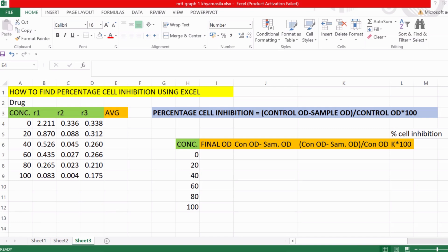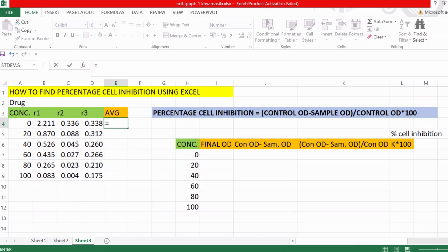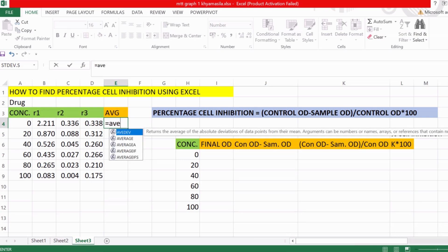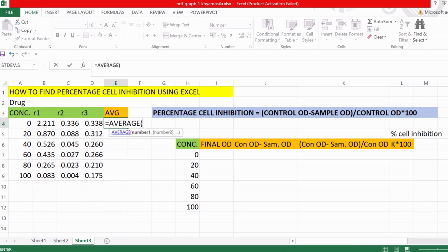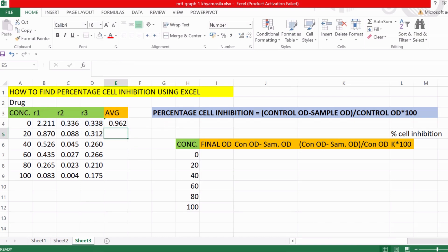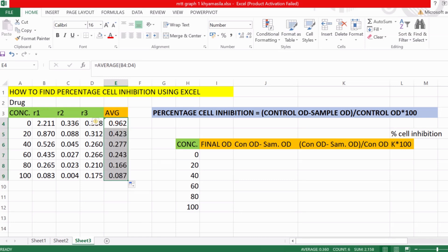First, what we need to do is find the average. To find the average, put an equal-to sign, search for the AVERAGE function, then select these three cells and press Enter. This gives the average of the control — zero is the control. Then drag this formula down to the last concentration, and it will give separate average values for each concentration. This average is the final OD which will be used in finding the percentage cell inhibition.